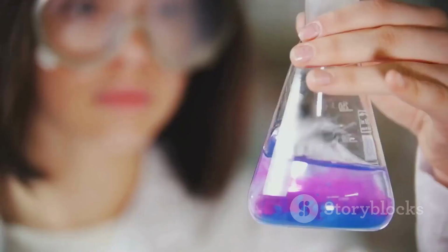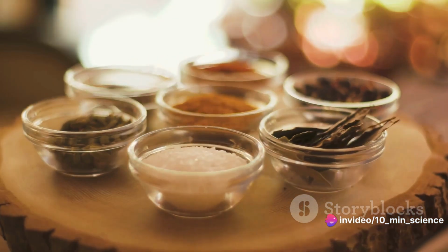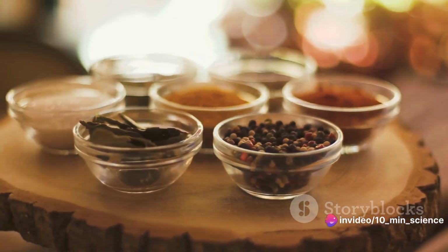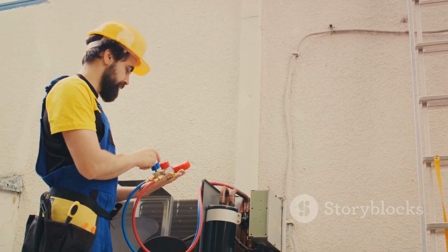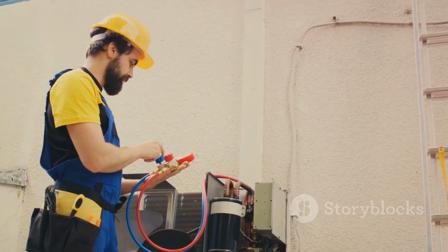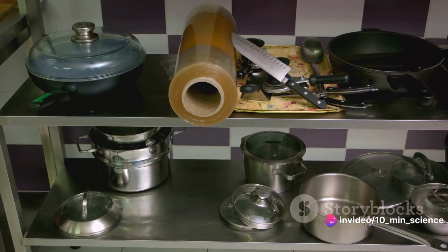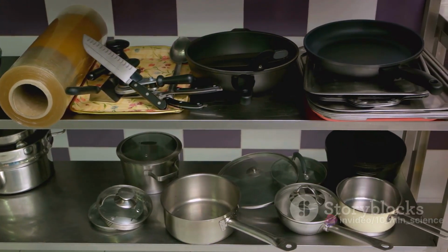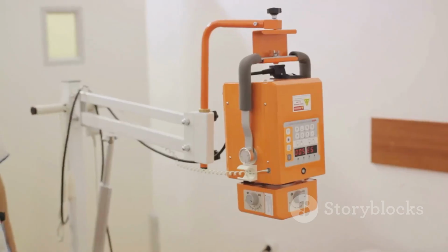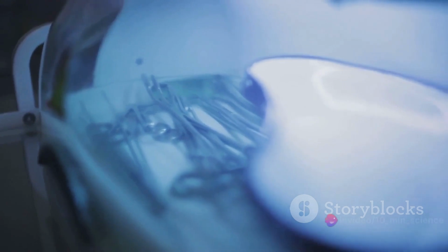Next, we need to prepare our reagents. The reagents are like our seasonings, each one critical to the final outcome. For the alginates assay, we need to prepare 3 reagents. The sodium edetate solution is our primary reagent, while ammonium chloride solution and ammonia solution function as auxiliary reagents. Each of these reagents needs to be prepared according to the specifications outlined in the USP chapter <311>. Now, on to setting up the necessary equipment.